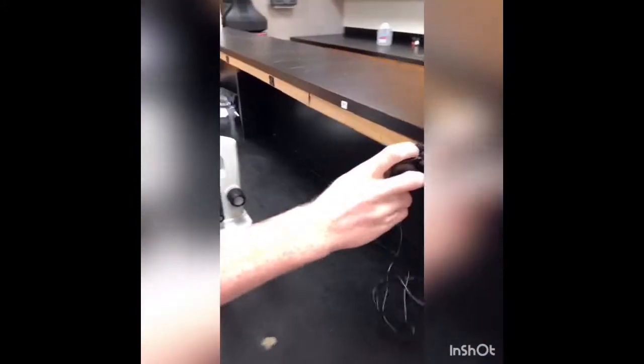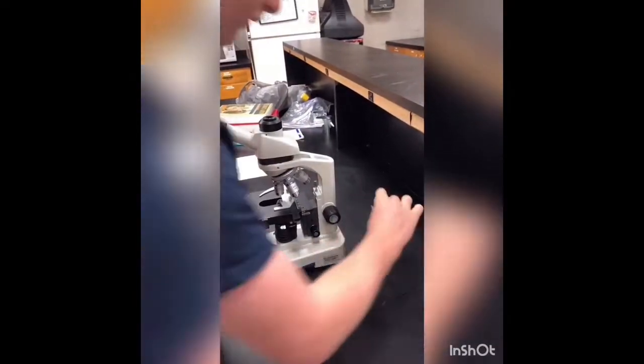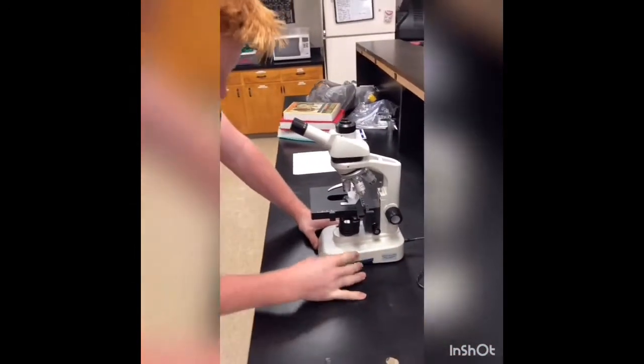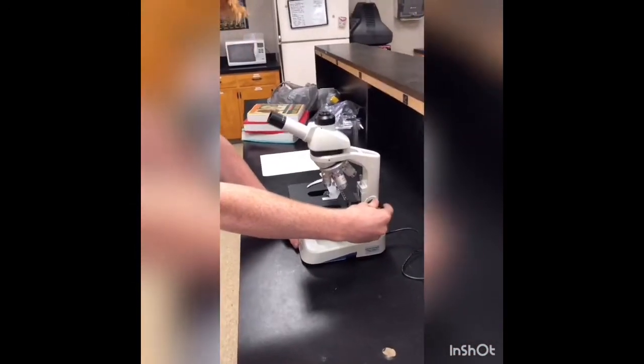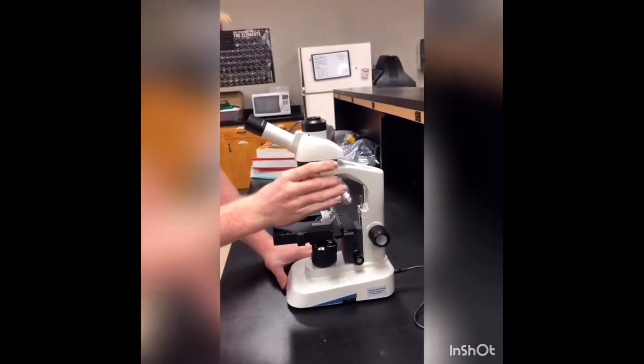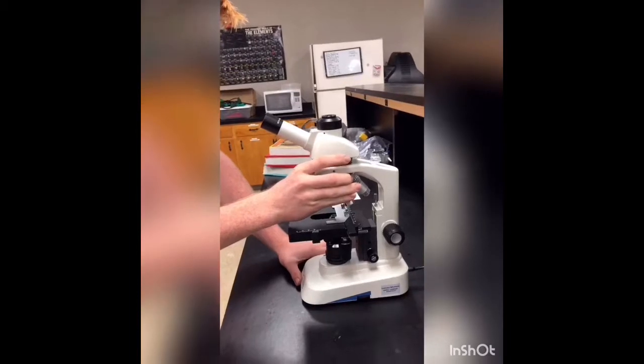You're going to take your power cord and plug it in so that it's not hanging off the desk. Then you plug it into the microscope here. And then you want to make sure that everything's on the right spaces. You want to put your stage all the way down. You want to put it at the lowest power magnification.